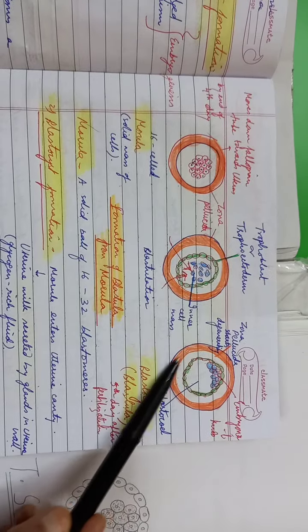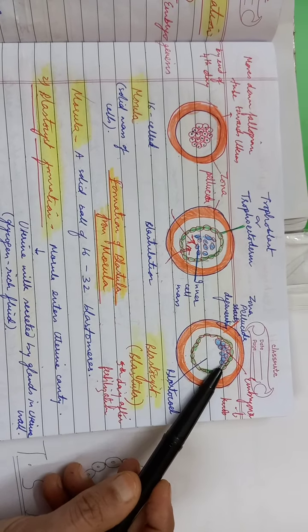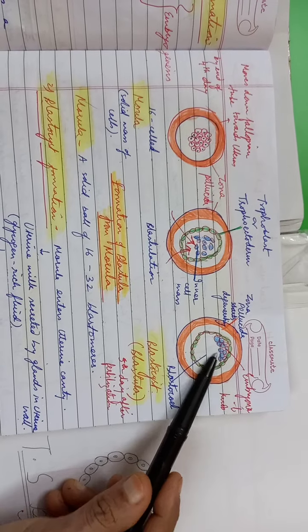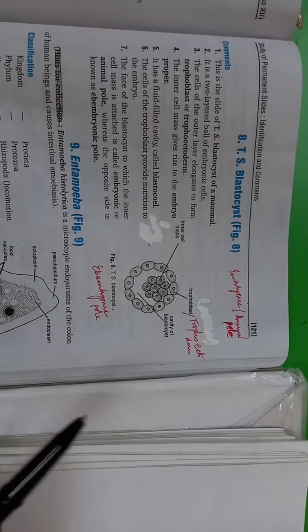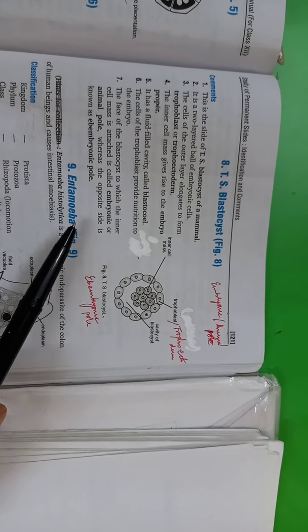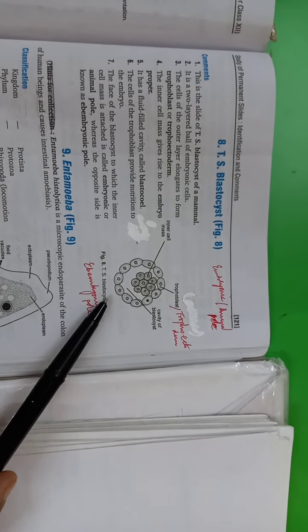You are studying this for the practical purpose today, right? That is the blastocele, the cavity inside, the embryonal knob or the inner cell mass that is collecting in one corner, and the trophoblast. So this is what we study for practical work today. The work is very simple, children, and I expect you to write 7 simple points today itself, and the simplest diagram of all the diagrams in your file, right? So this is the work for today.